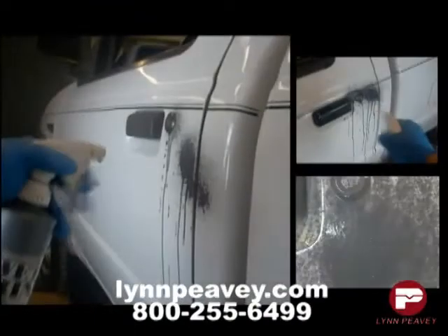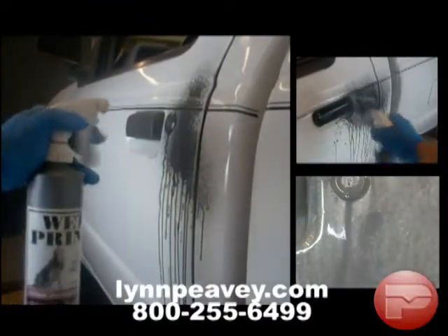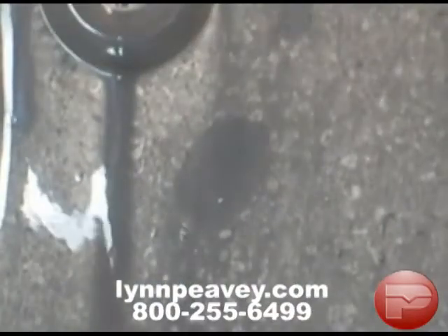Turn the spray nozzle to a fine mist position and spray the surface containing the latent prints. Limpiede's Wet Print is very much like a liquid fingerprint powder. Wet Print contains extremely small particles that adhere to the latent print residues as soon as it is applied to the wet surface.